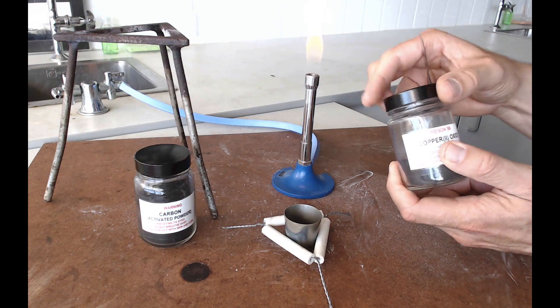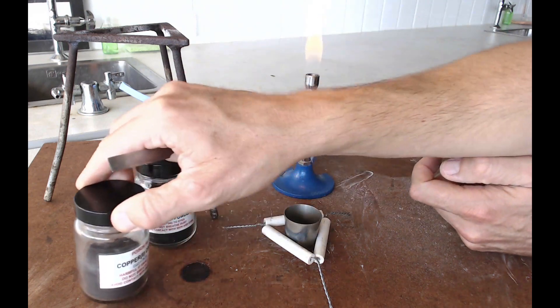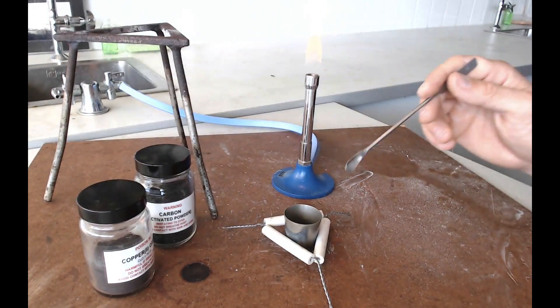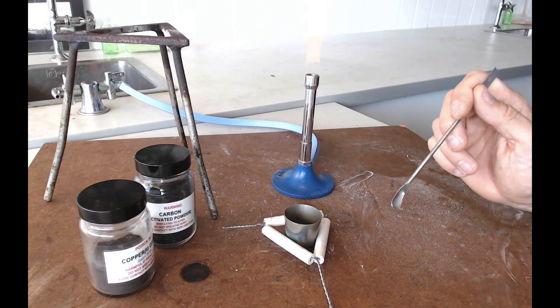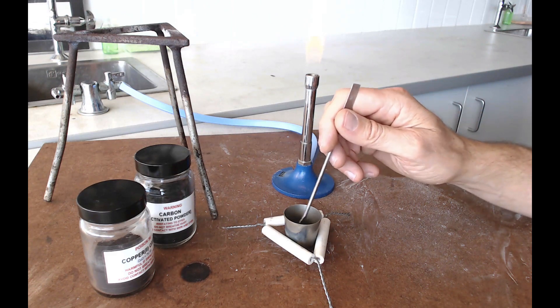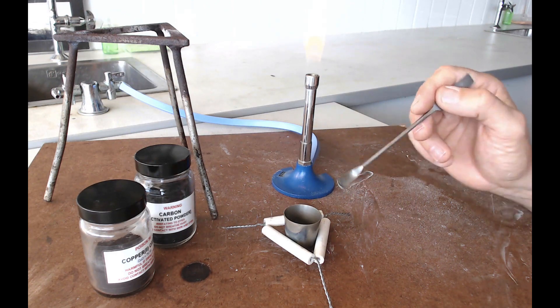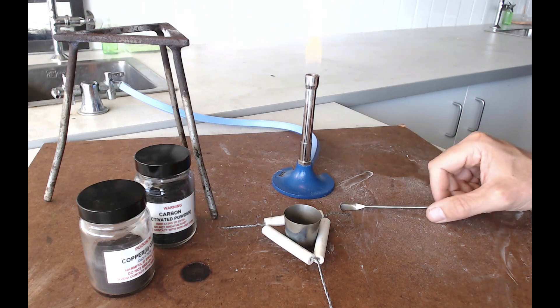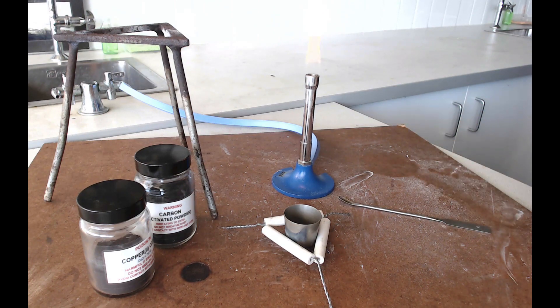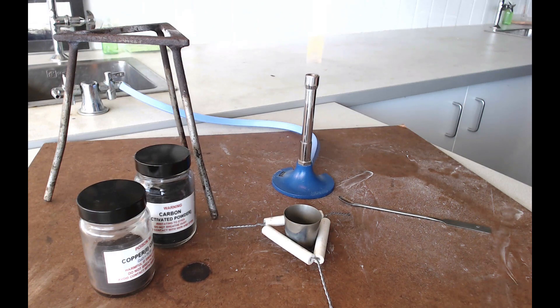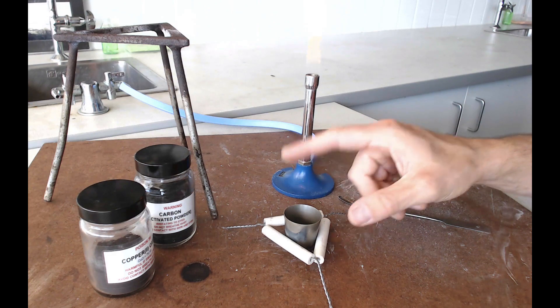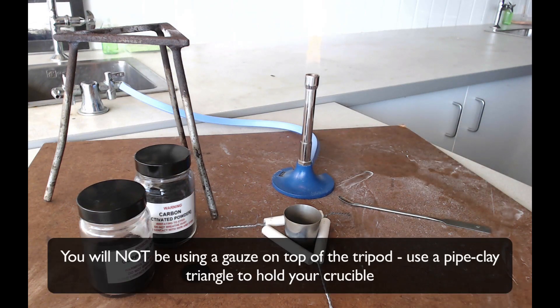Now you want three or four heaped spatulas of these two solids to go into your crucible. Once you've put them in there, give them a good stir before you heat anything up. Now the aim here is to try and heat the carbon so strongly that it's able to take the oxygen away from the copper oxide and to do that we're going to need to put our crucible on top of the tripod and heat it with a Bunsen.